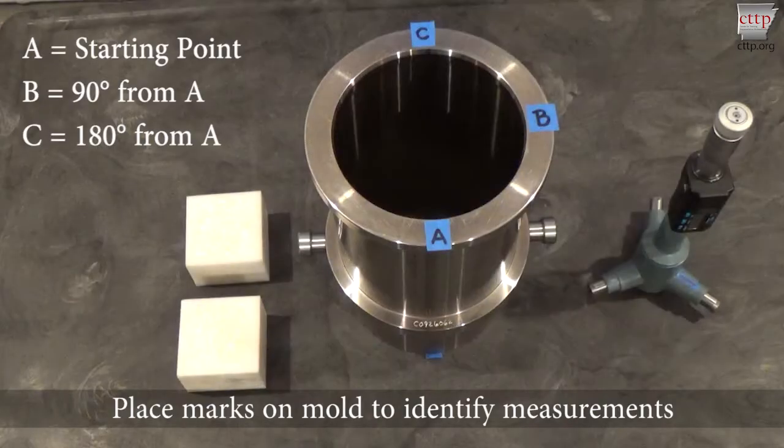Place marks on both the upper and lower rims of the mold to identify the measurement locations A, B, C. A is the starting point and may be at any point on the rim. B will be 90 degrees from A and C will be 180 degrees from A. Mark corresponding points on the other end of the mold.